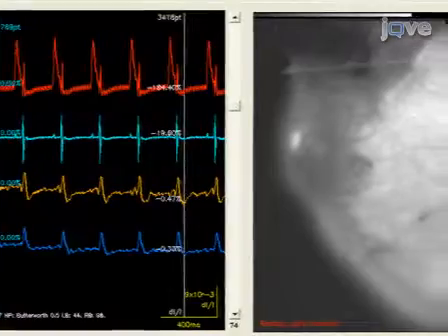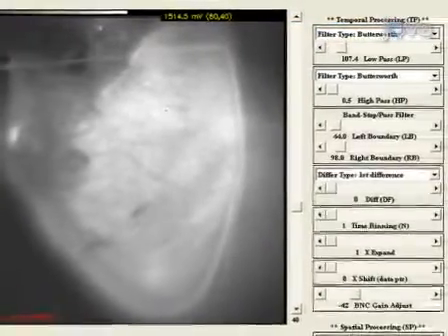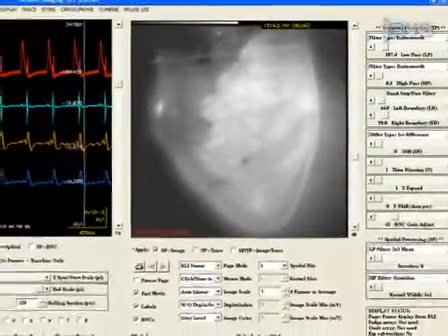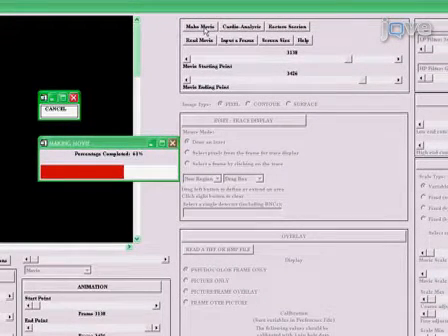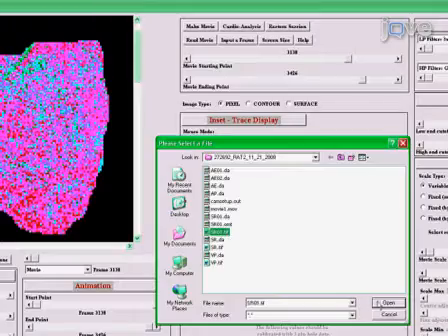The software allows these local signals to be directly compared with one another and with the atrial and ventricular electrographic recordings. Select the data by mapping local electrical activation to color and render this information as an animation showing the spatiotemporal electrical activation on the cardiac surface. To create such an animation, first use the software to temporally and/or spatially filter the data. Next, select a start and end time for the animation. Third, map optical signals to color based on resting light intensity of each pixel. Fourth, overlay the resulting color data with a picture of the heart and finally generate the animation.